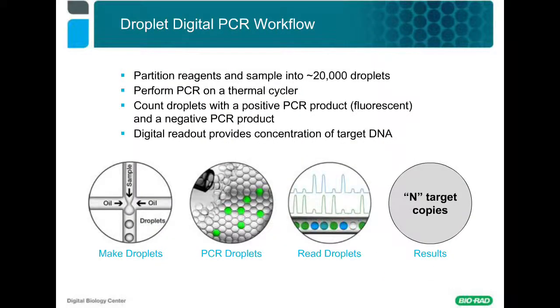At the core, Droplet Digital PCR, or ddPCR for short, is a revolutionary new technology that allows for precise and absolute quantification of nucleic acid. There are essentially 3 simple steps prior to receiving quantitative results. First, the partitioning step, where a standard 20 microliter PCR reaction containing sample, master mix and assay, primers and probe, is divided into about 20,000 uniform nanoliter-sized droplets by the droplet generator instrument.